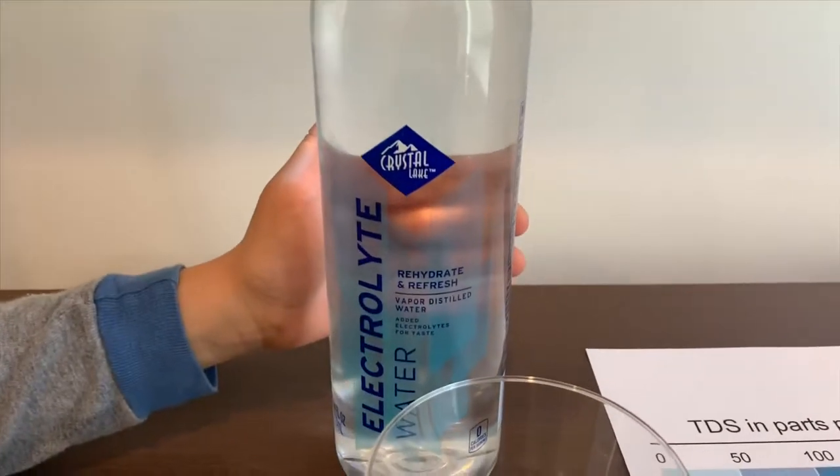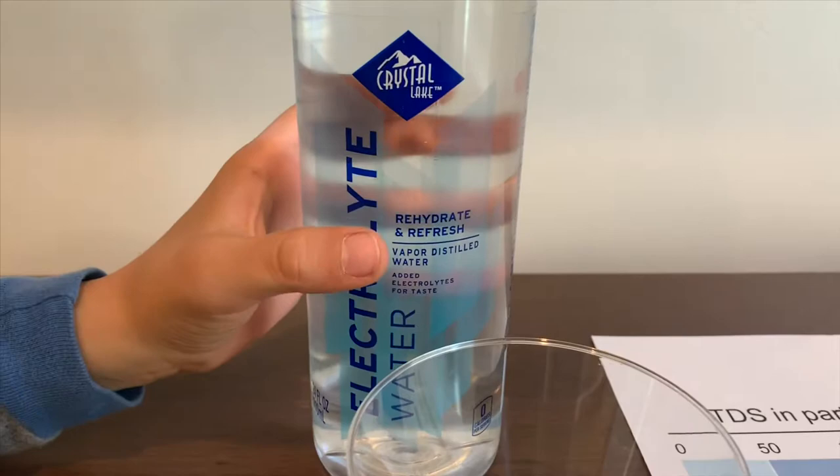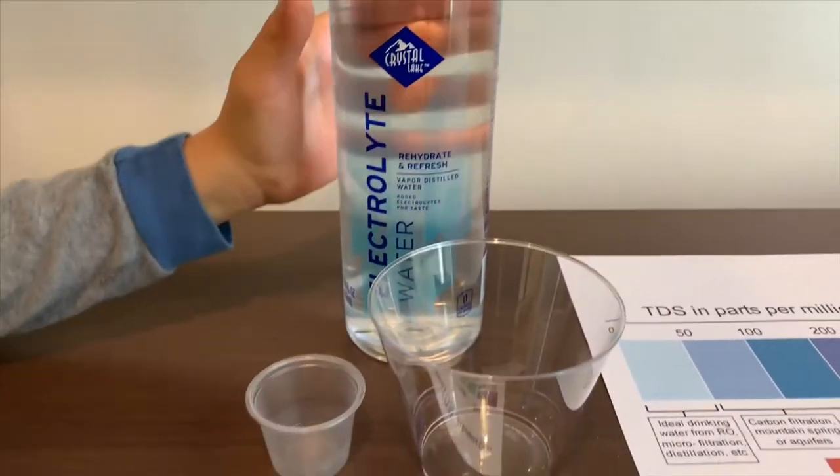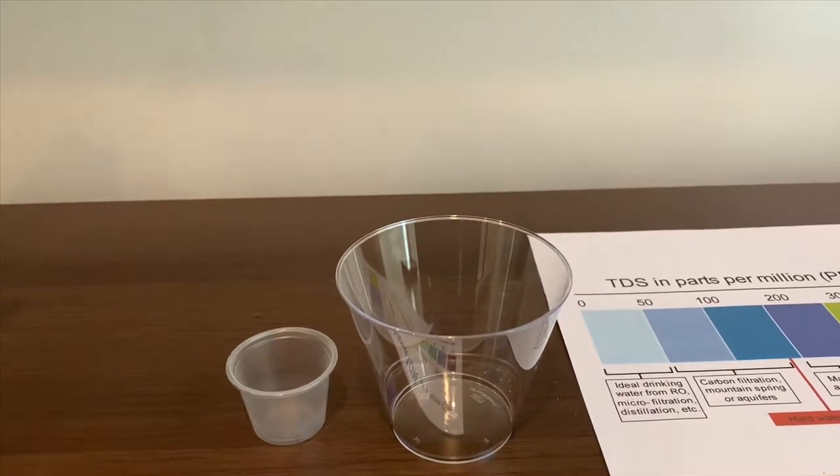This is Crystal Lake purified water with electrolytes for taste. It's also vapor distilled. Let's test the TDS and pH levels. It costs $1.39.